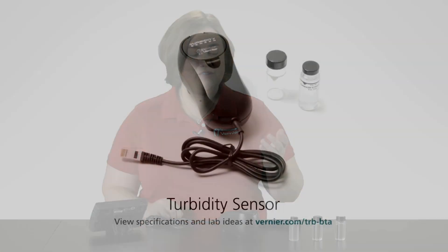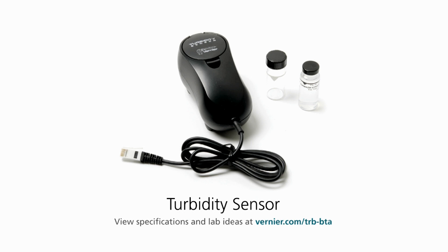Today I'm going to talk about the Vernier Turbidity Sensor and using it with our LabQuest 2. The Vernier Turbidity Sensor is often used with water quality measurements to measure the amount of turbidity in a water sample. Turbidity is looking at how cloudy that water sample is and how many particulates are actually suspended, giving us an idea of the quality of that water sample. The turbidity units it's measured in are NTUs, or Nephelometric Turbidity Units, which is a national standard.